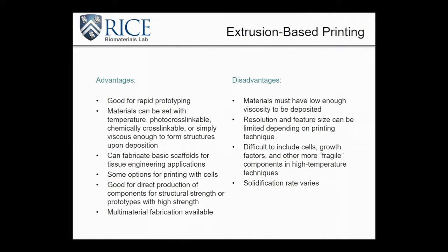And like I said, this kind of goes in line with using some of those thermoplastics, but for instance, we can get very good production of really strong, structurally sound geometries and objects, which is kind of unique to extrusion-based printing when compared to inkjet printing and a couple of the other methodologies that we'll talk about later. And of course, with a lot of these extrusion-based printers, it's really easy to incorporate multiple materials. This is going to be absolutely crucial to some of the important strategies that we get to in the next several slides in the lectures.